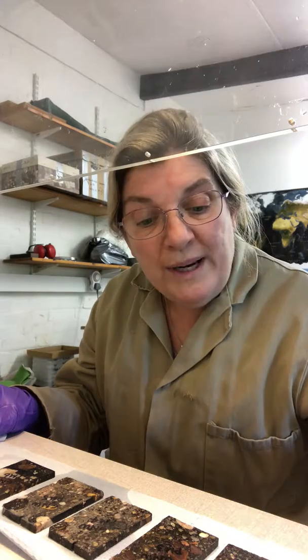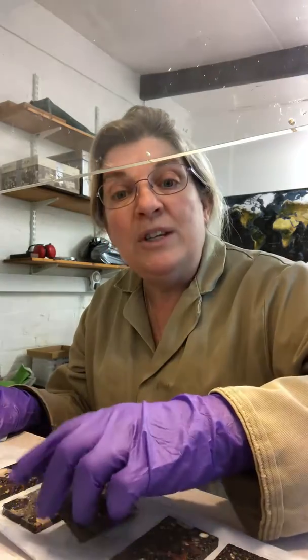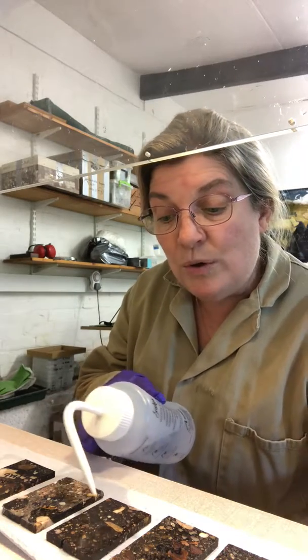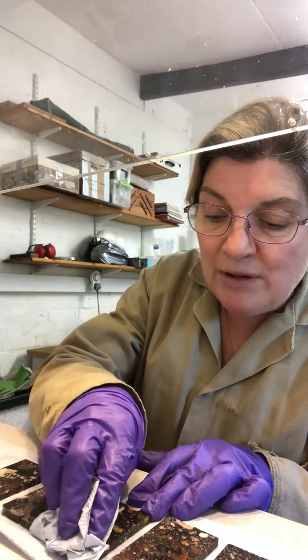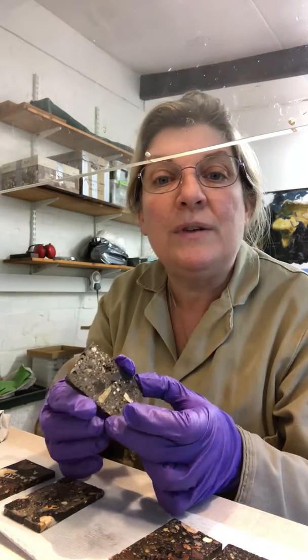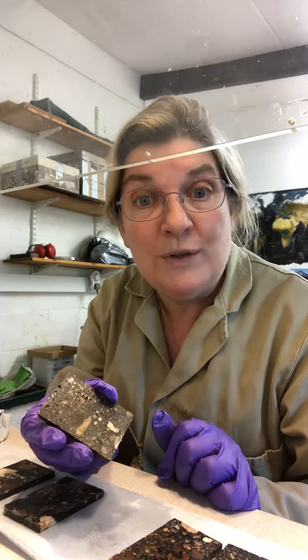So we flood all our samples, we pull the acetone off, then we turn them over, and you do the same on the fronts, which really are the faces we're going to bond to the glass. So let's have a look at one. And that is beautiful. Look at that surface. So the oil has almost completely been removed.